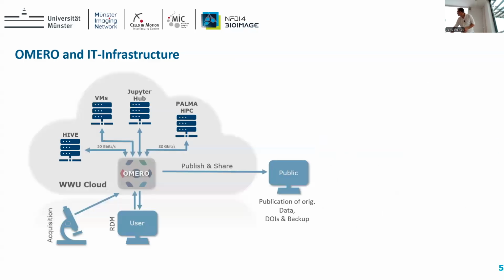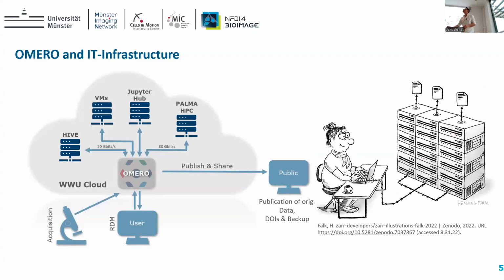Yeah. Maybe because we have a lot of single image analysis, stuff like this, and not so much high content analysis. Yeah. Thomas, sorry, all the data that are displayed in Omero, they are in the cloud, right? Or can they also be on the Hive? Or no, they are in the cloud. Okay, so on the Hive you don't use Omero.